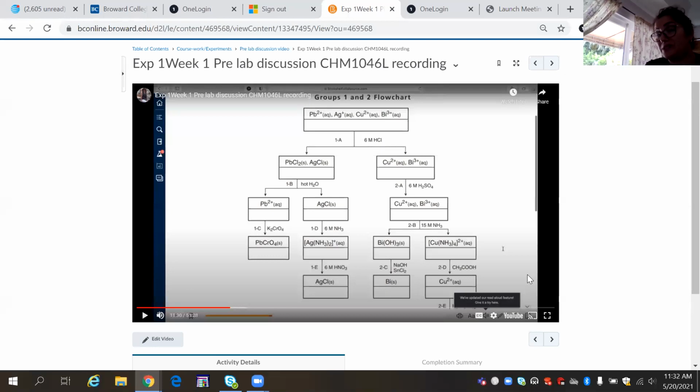So when you get the precipitate and those 2 steps, don't look for a jet black color. Even though it says look for the black precipitate, there would be only a couple spots of black precipitate for the bismuth. So that is how you confirm that you have bismuth.